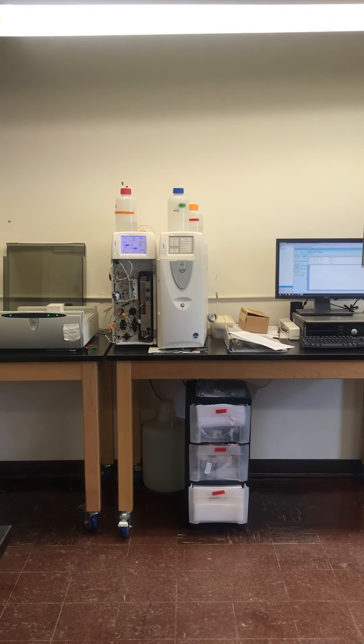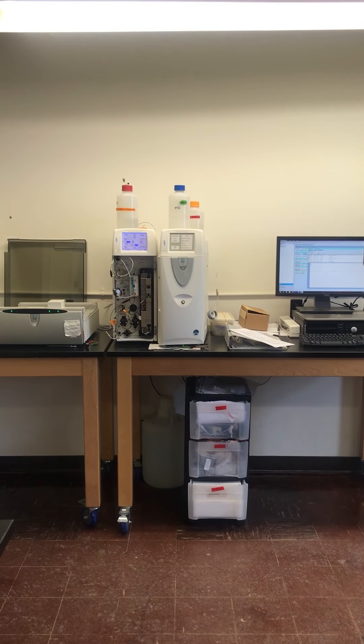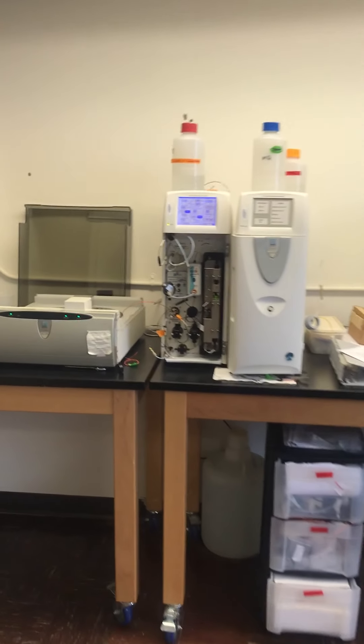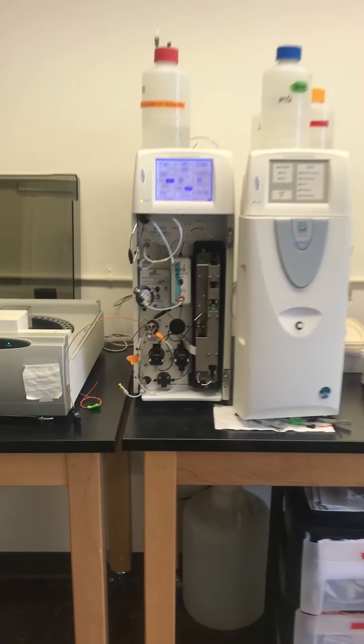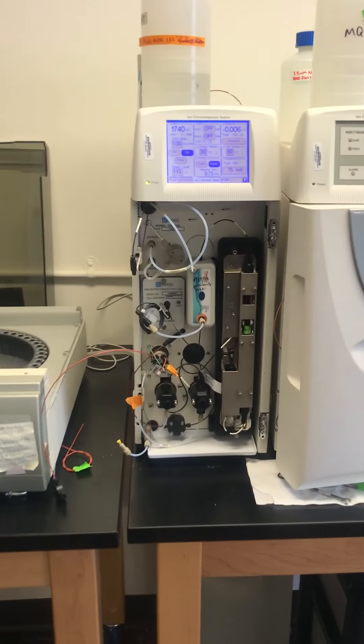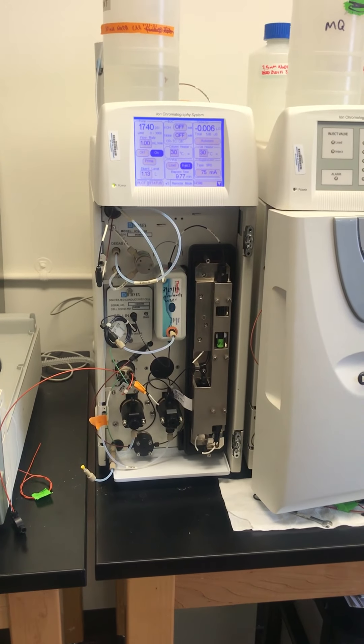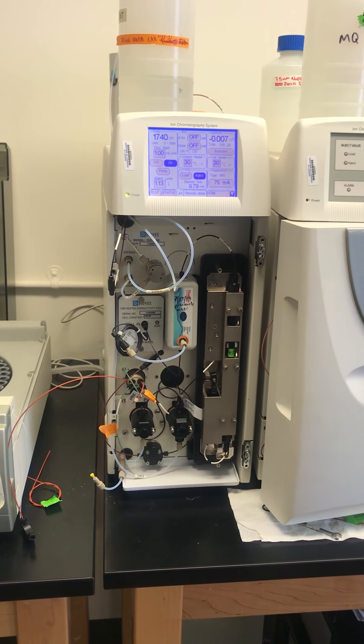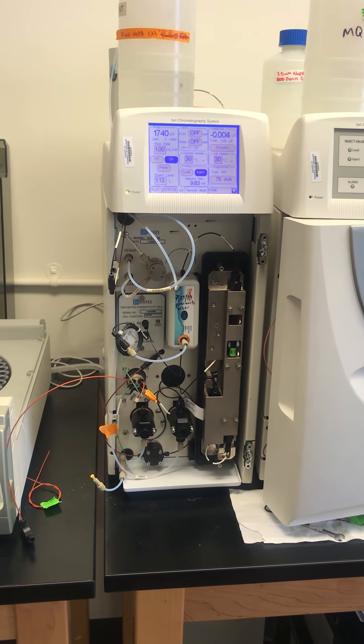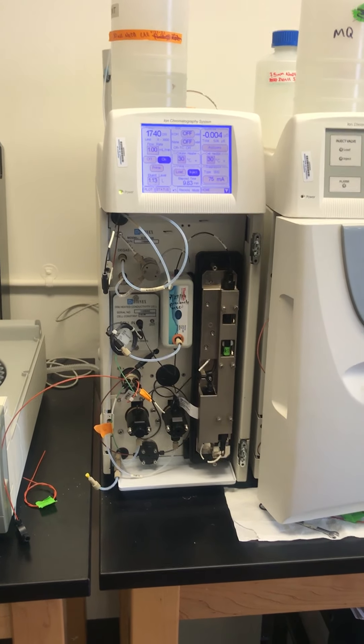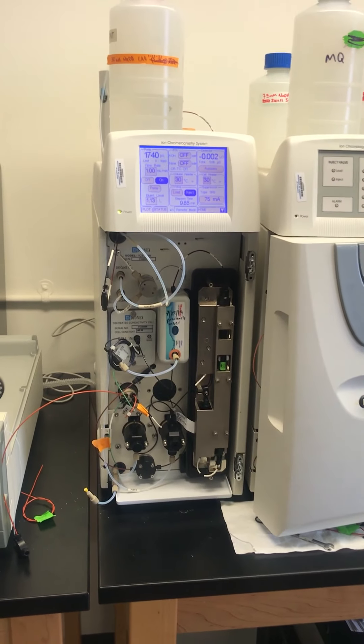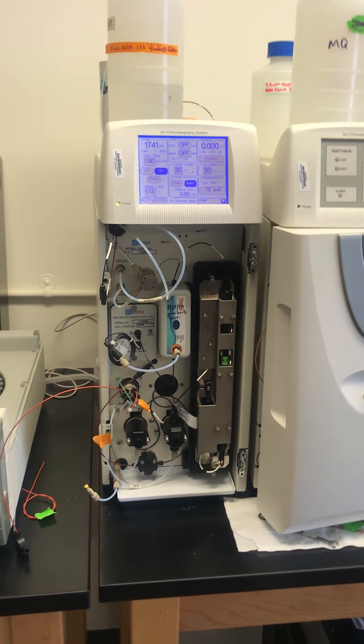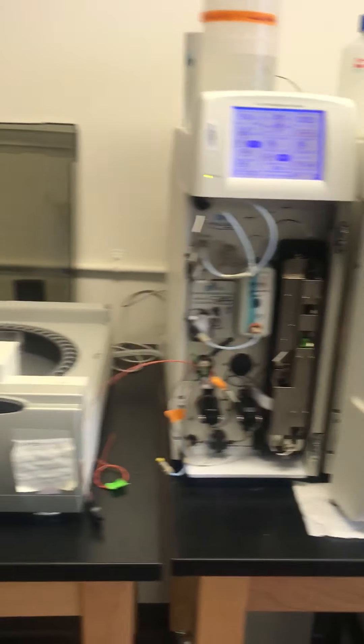Here is the setup at the lab. This machine here in the middle is the ion chromatograph, and this is what we use to analyze each water sample for chloride concentration. There are three important parts to this machine.